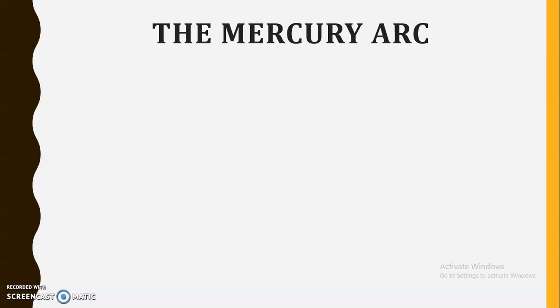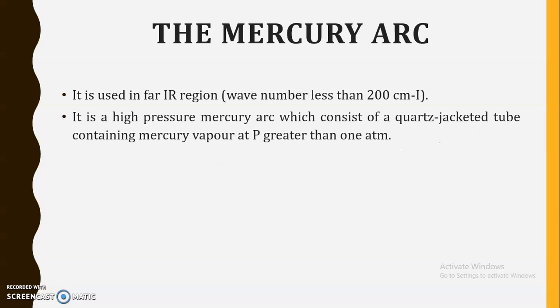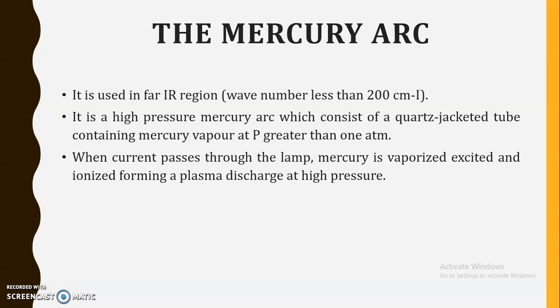Then the next radiation source that we are going to discuss is the mercury arc lamp. Generally, the mercury arc lamp is used in the far IR region, where the wave number is less than 200 centimeter inverse. It is a high pressure mercury arc, consisting of a quartz jacketed tube containing mercury vapor at a pressure greater than 1 atmosphere. As the name suggests, this arc is made up of mercury, jacketed in a quartz jacket containing mercury vapor.